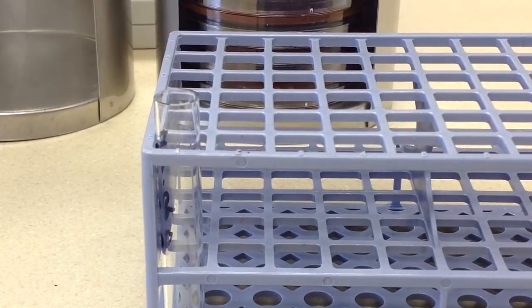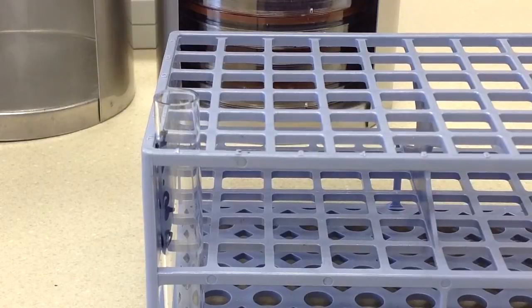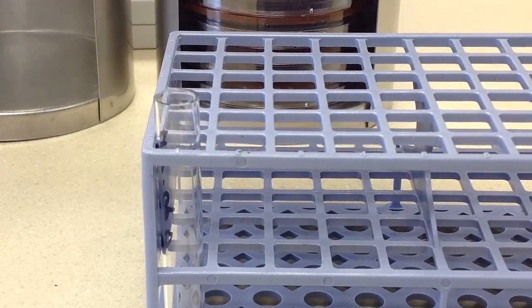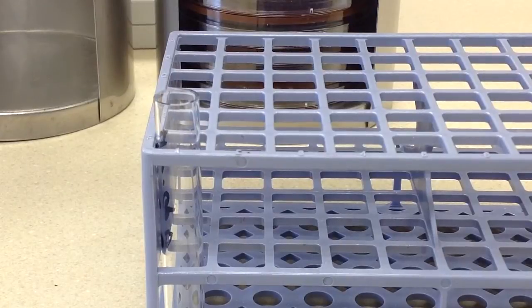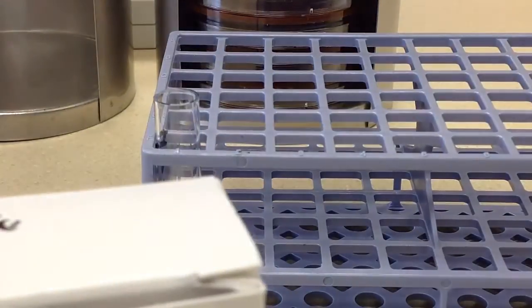In this video, we are going to take a look at doing the Hippurate disc test. This test is used to help identify Streptococcus agalactiae, otherwise known as Group B Streptococcus.